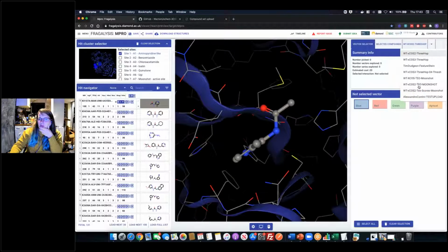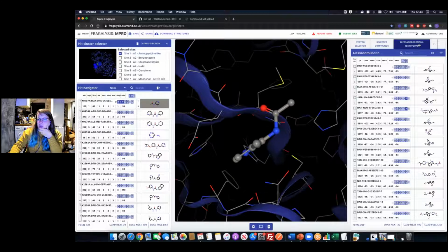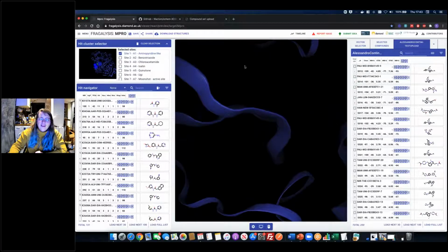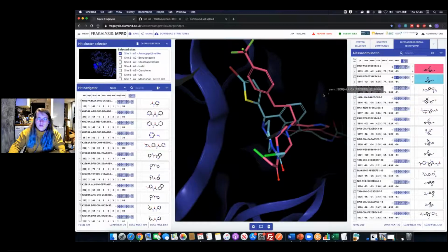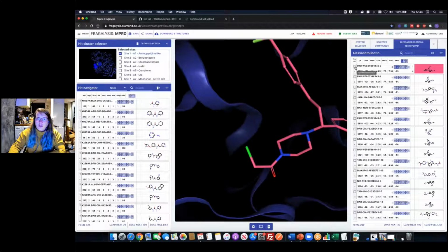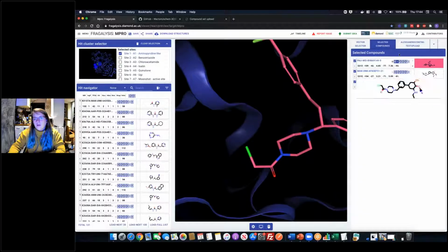Okay, so I was here, and I was going to do something. I don't remember what it was. I think you're just going to show the interactions with the novel ligands. Yeah, probably. So, oh, I know what I was going to do. So we'd done some filtering and sorting and decided, and then I was going to go through the scenario of if you'd had a look at some of these visually and made a decision on what you wanted, then you can make a selection of ligands, and they'll appear in a summary in the selected compounds tab.